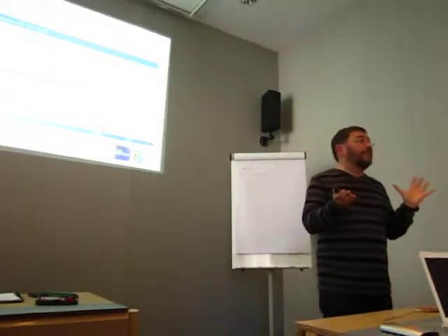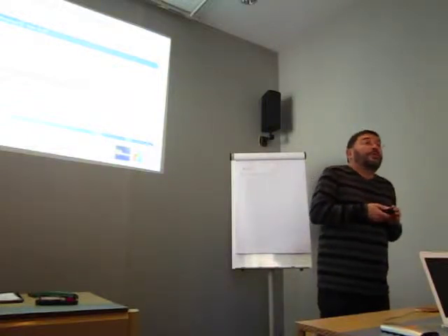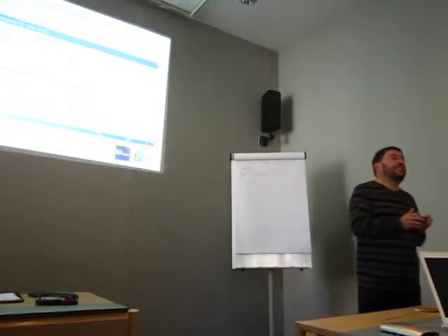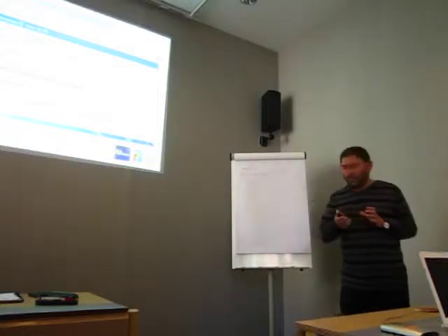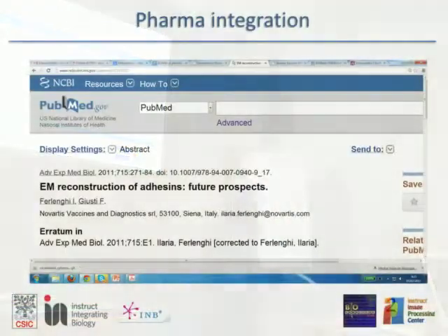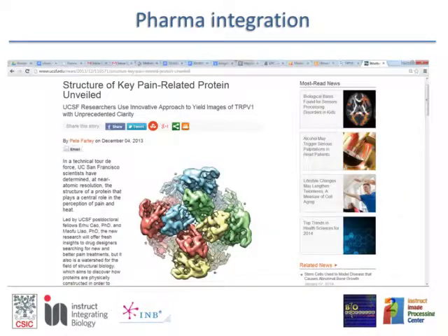The people of you coming from X-ray diffraction, you know that pharma is already there. In the case of electron microscopy, our soft, until now relatively limited resolution has made more complicated the interaction with pharma. But this is Novartis vaccines and diagnostics, so really the pharma is getting into that. And with the new direct detector devices, what I'm showing you is probably the first molecule solved by electron microscopy in December at atomic resolution of a clinically relevant molecule without any prior information, just coming at atomic resolution from electron microscopy, not from 2D crystal or anything like that.